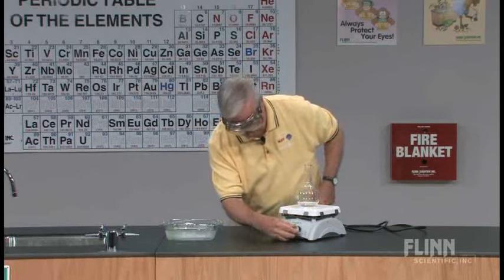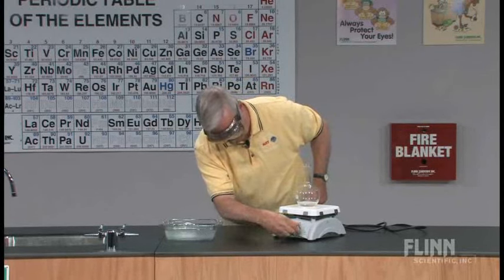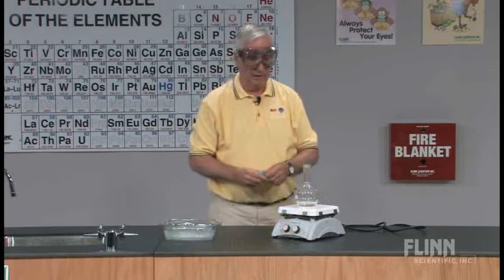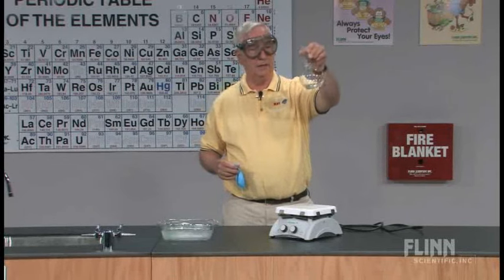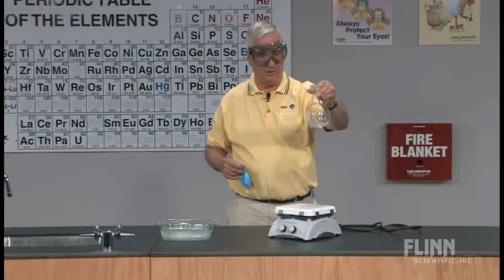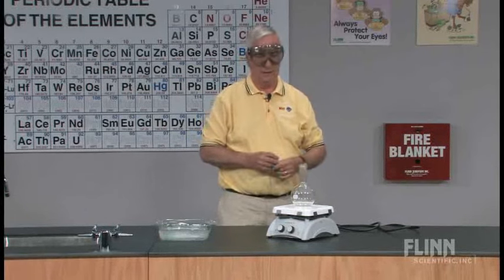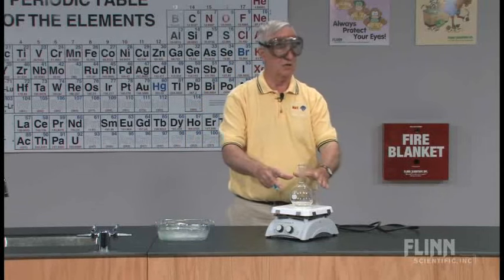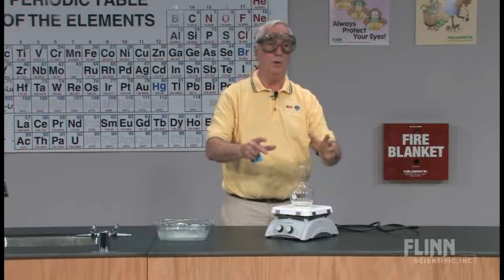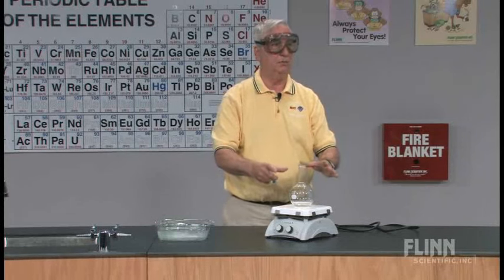Now, what I have here is a flask, and in the flask we have some water — simply distilled water or tap water. It doesn't matter. The distilled water doesn't create any mineral deposit. And what we do is, because the flask is already filled with air, we want to purge the flask of the air and replace it with water vapor.